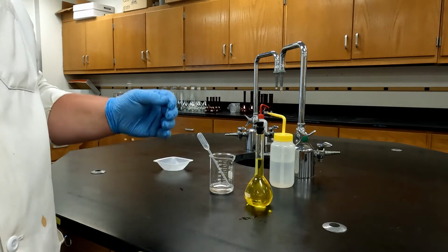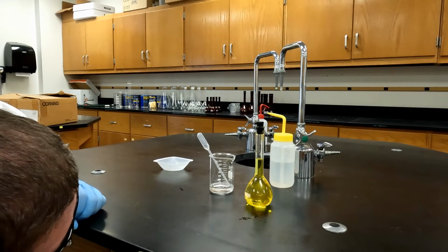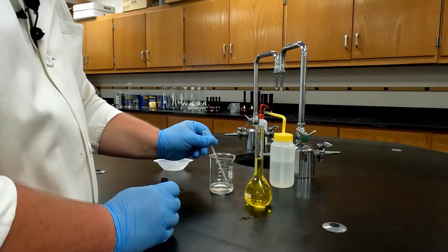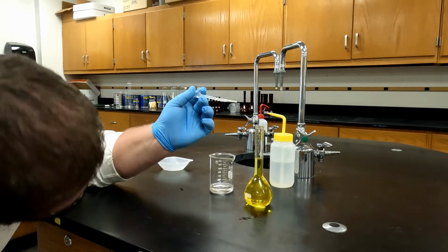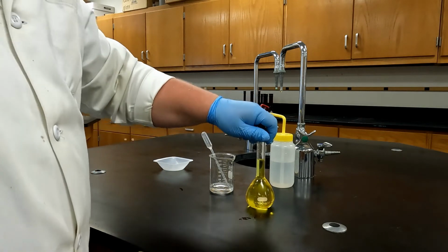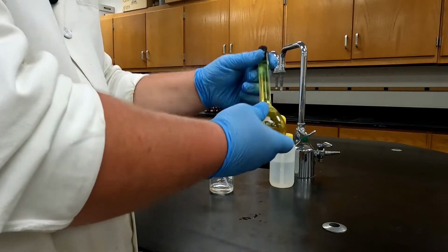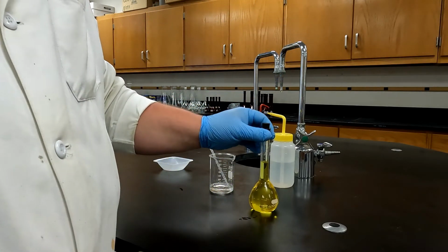Once I've shaken it and I've inverted it several times, I'm then going to double check the meniscus and make sure that it is still directly on the line. In this case, it's actually not. It's actually dropped just slightly below. I'm going to unstopper the flask and add a few drops of water until the meniscus gets right back on the line. Invert a few more times to make sure it's thoroughly mixed. And then you want to check the line again to make sure the meniscus is set correctly.